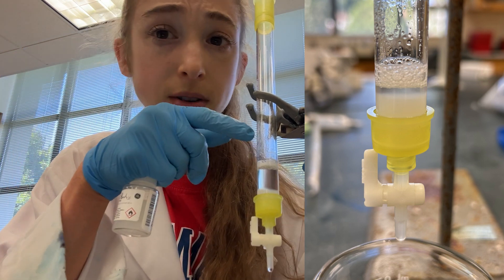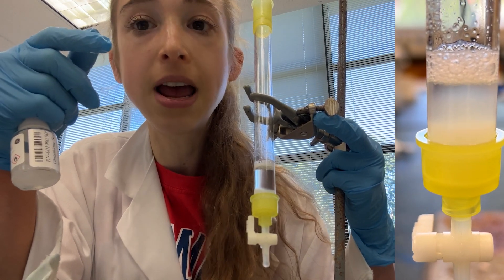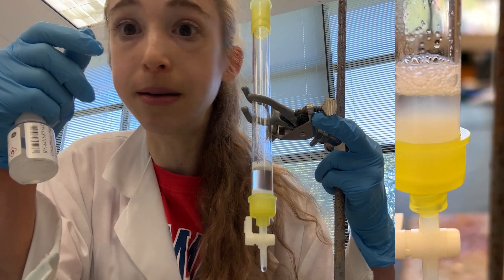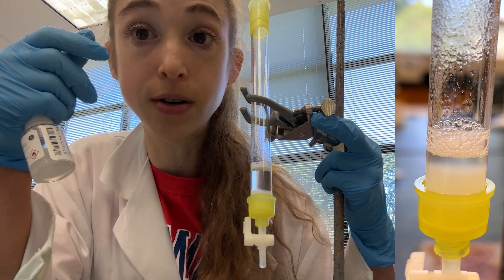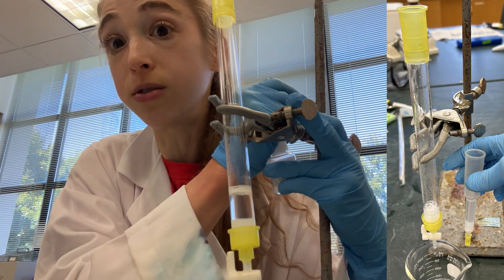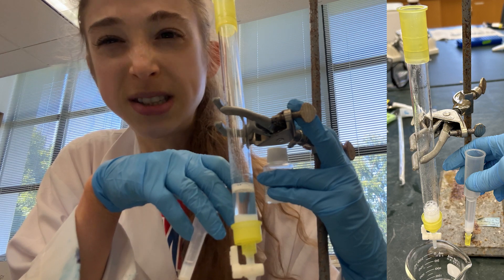Often it doesn't need to be very precise when doing affinity chromatography, but we do want to know the column volume because it tells us how many washes to do. We also want to customize the column volume based on how much protein we expect, the binding capacity of the resin, and the volume we have. Even if the binding capacity is sufficient, if you have a really large volume the protein will be really diluted — all those protein molecules will have to have a chance to run into one of those resin molecules, so it takes more time. You can increase the incubation time, or add more column volume. Going up in column volume slows down the flow rate. Some resin is a lot more expensive, so you want to use as little as possible while still getting the job done.